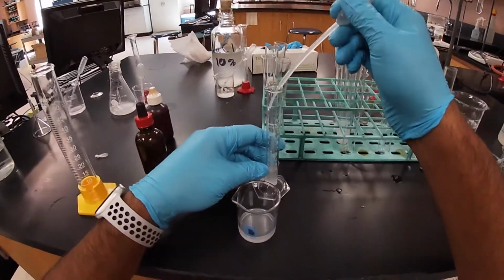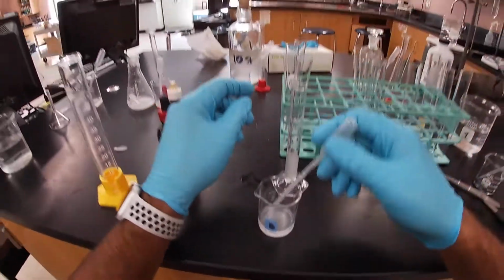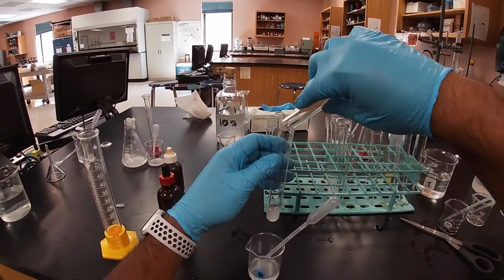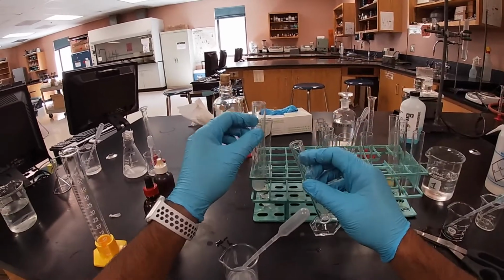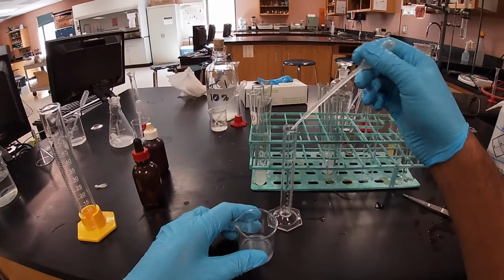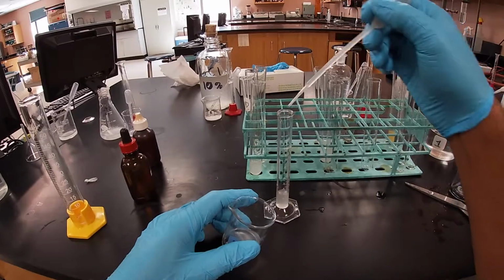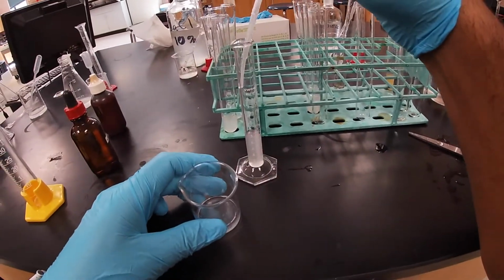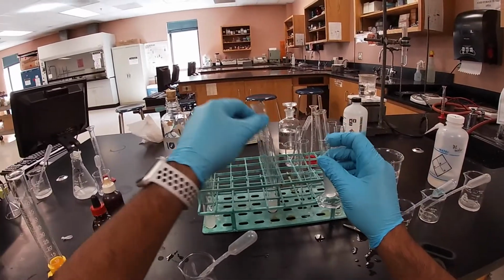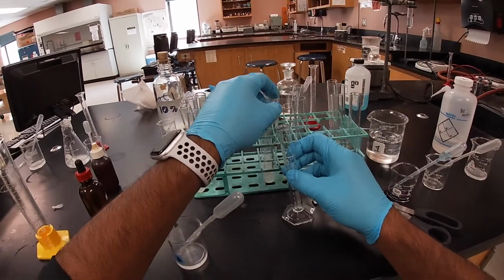Okay, measured out 5 mLs, put in our first test tube. Okay, so remember that this is the inside content, the dialysis tubing, after being submerged in water for 30 minutes. So measure 5 more mLs, put in another test tube, and then we're gonna fill up our last test tube.